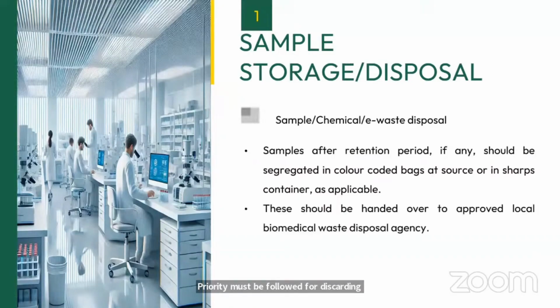This should be handed over to an approved local biomedical waste disposal agency. So there should be an appropriate MOU with the biomedical waste agencies which are approved, which are authorized. To them only you should be able to hand over the waste. Now many a times from my experience I have seen there are many small labs.